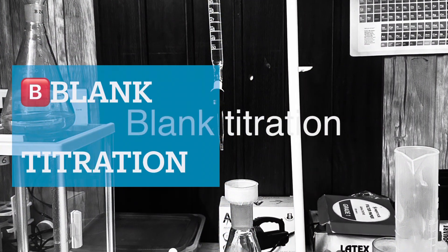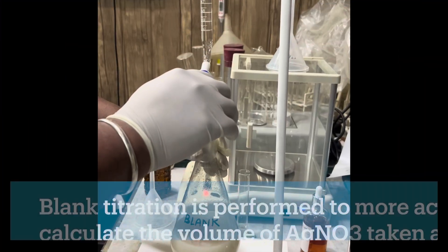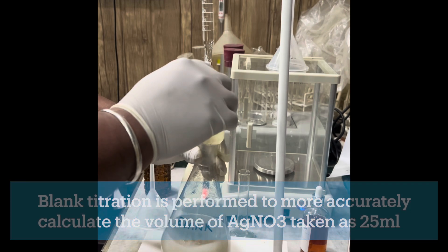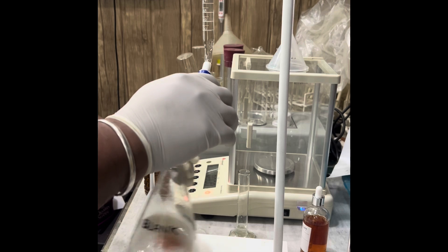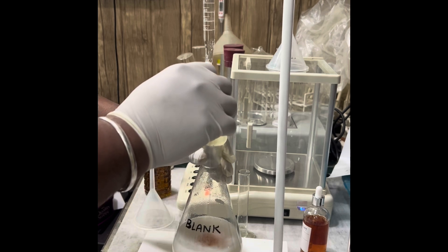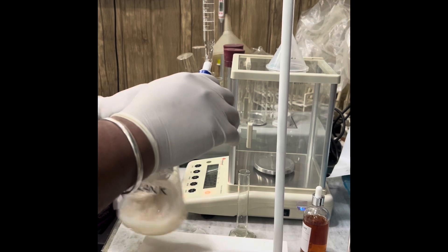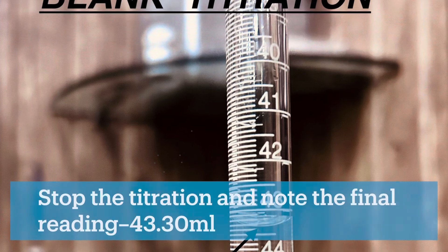For the blank titration, again note the initial reading and titrate the blank titration flask in the same way. The 25 ml of silver nitrate taken will be accounted for by this blank titration and will be represented by the volume of ammonium thiocyanate used. When the color changes to red-orange, stop the titration and note the final reading.